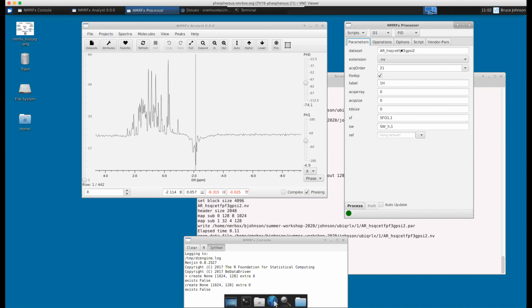When we process this, this is the name of the pulse sequence. And so by default, the processed file is going to get that name, but we could have typed in hsqc.nv or hsqc. By default, I process into nmrview.nv format, but if heaven forbid you're a Sparky user, just change this to UCSF and you'll get a UCSF file. Spectrometer frequency and sweep width, instead of actually having to put in the exact numbers, we put in symbols from the Bruker parameters. So SFO1 tells us to get that parameter for the spectrometer frequency out of the acqus and acqu2s files, get the sweep width.